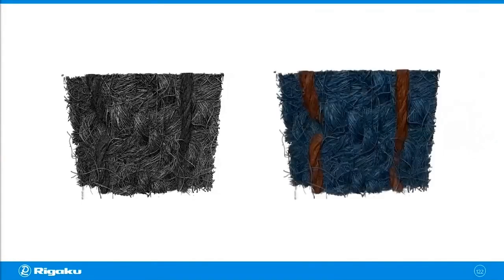And this is just one cross-section, but this is the original 3D CT scan image. Again, you can barely tell the difference between the main fabric and the thread, but a well-trained network can separate them into two different phases. And as you can see here, deep learning is a very powerful way to do image segmentation.